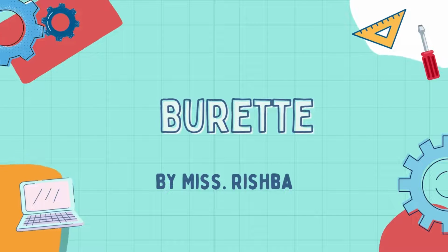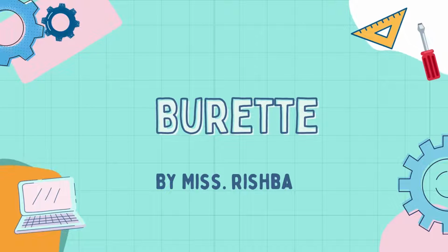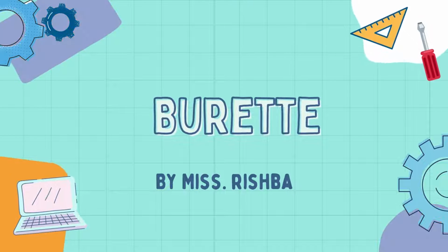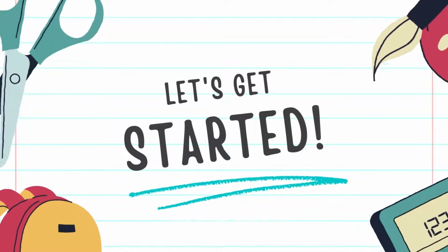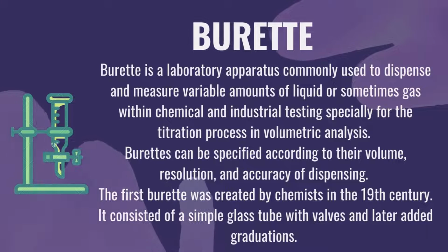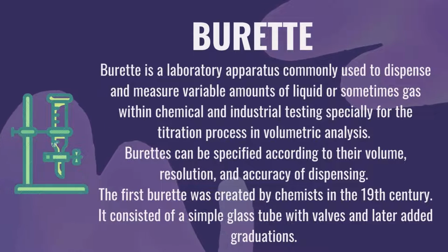Again, I am here with a very entertaining topic. Do you know what a burette is? So, let's get started. Dear friends, a burette is a laboratory apparatus commonly used to dispense and measure variable amounts of liquid, or sometimes gas, within chemical and industrial testing, especially for the titration process in volumetric analysis.